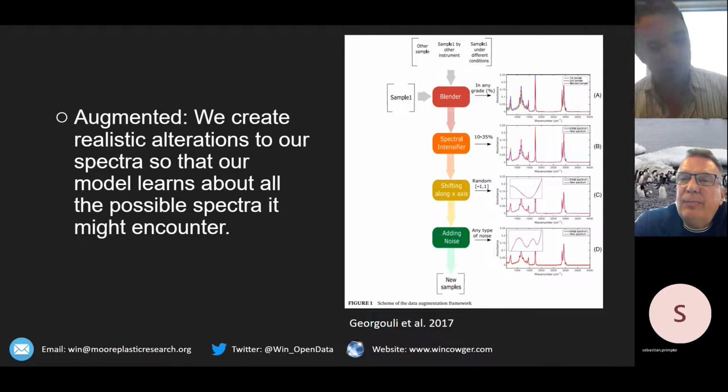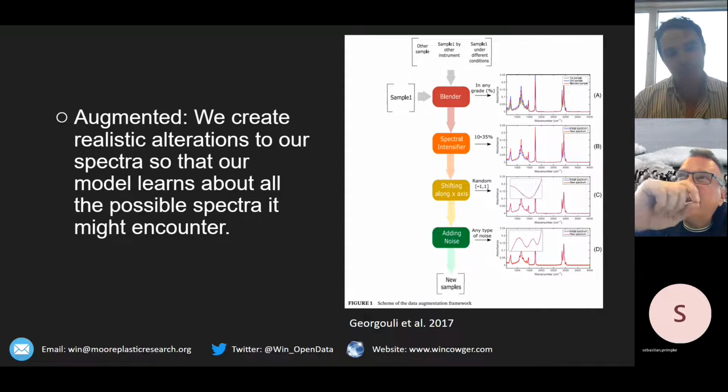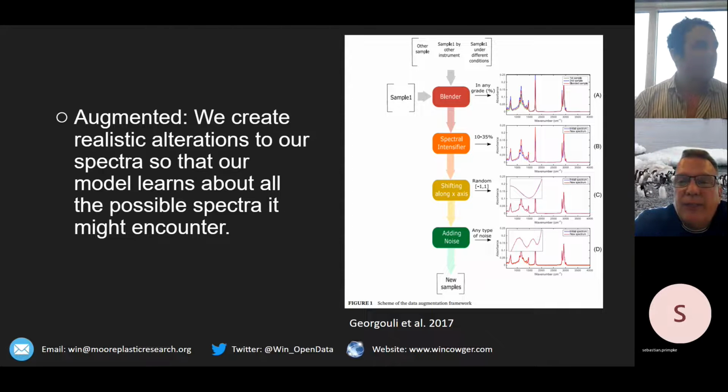Yeah, I think it's very much needed. We've been in touch with Frontier, who make the pyrolysis units for this work, and they are building up databases that we will need both for the plastics but also for additives. And we think, in theory, the technology would also be able to detect, say, if there's more than 20% of additives in the plastics, you will be able to pick up a signal. But there are things ongoing. I will meet hopefully the people from Frontier in the beginning of next year in March.